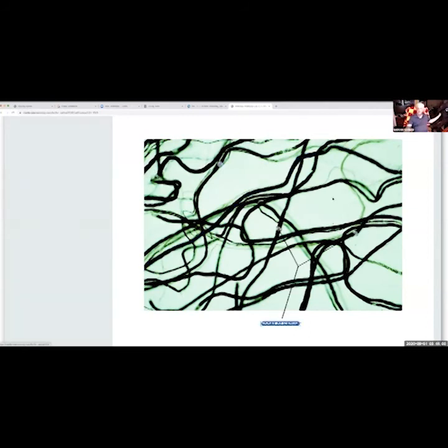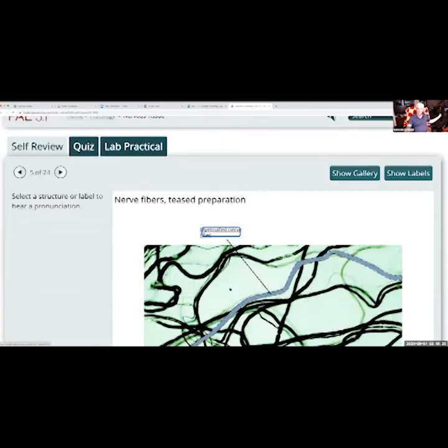Okay, and you'll see them every once in a while. You'll see one right here. You see ones without the blue stuff in the way. Okay, that's the best one right there. See it right there. Those are where the myelin sheath is not continuous. But all your fast nerves have a myelin sheath around them to conduct that electrical impulse extremely fast.